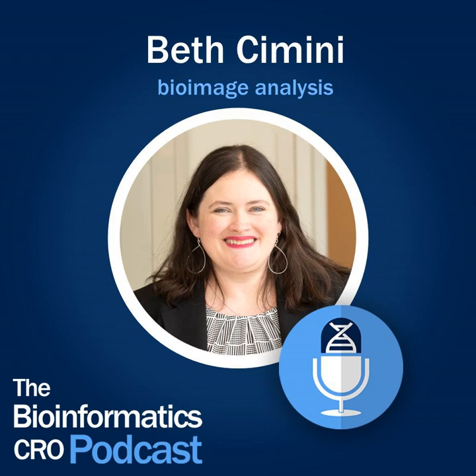We have a bioimage analysis bootcamp we run a couple times a year. And we spend a couple of hours talking about how machine learning in general, and deep learning in particular, will lie to you, will learn what it wants to learn, not what you want it to learn. And how can we out-lazy the assay to try to figure out exactly what the model has learned? One of my favorite points is to ask, what is the easiest way to train a classifier that you show a picture of a cell and ask if the cell is interphase or mitotic? Just say interphase, because about 95% of cells, it turns out, are in interphase, and you'll be 95% right. And most of us would take 95%. 95% is a good day.